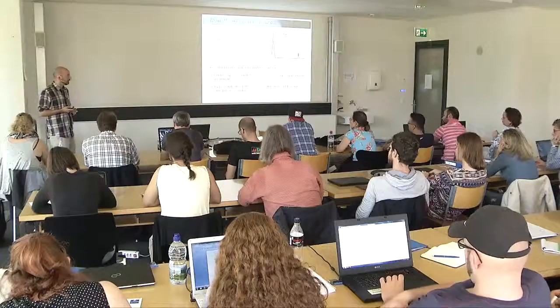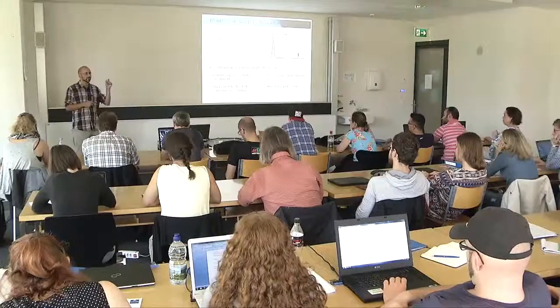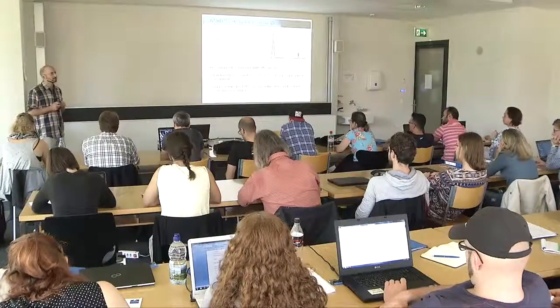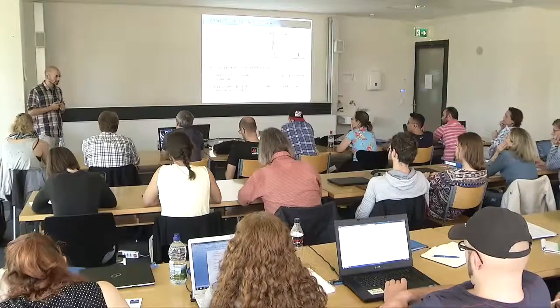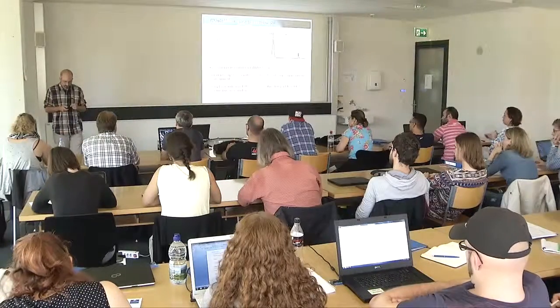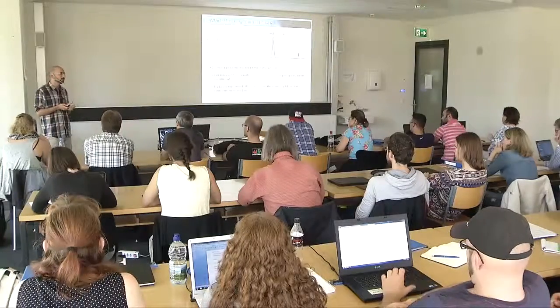Yeah. So, of course, everything that I've exemplified so far is with the case of one phosphorylation that is moving, let's say, along the peptide sequence. Of course, if we would have 2 or 3 phosphorylations, it would only increase the combinatorics of all the possible things. At the moment, I'm not aware of a software that does that.